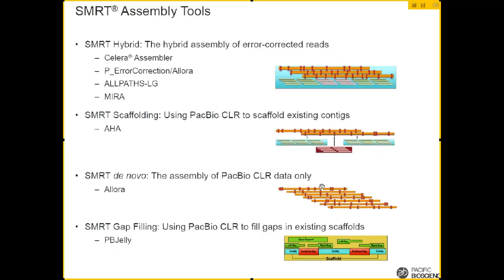These other examples are more or less the same thing. Their other idea, and of course PacBio is big on this idea, is that what you should really do is get lots and lots of their long reads and pay a lot of money, and then once you have enough long reads overlapping each other, you can use them in a similar way to error correcting the short reads, just error correct them with each other, a larger scale version of a consensus region. Yeah, that is most of what I have to say about PacBio.